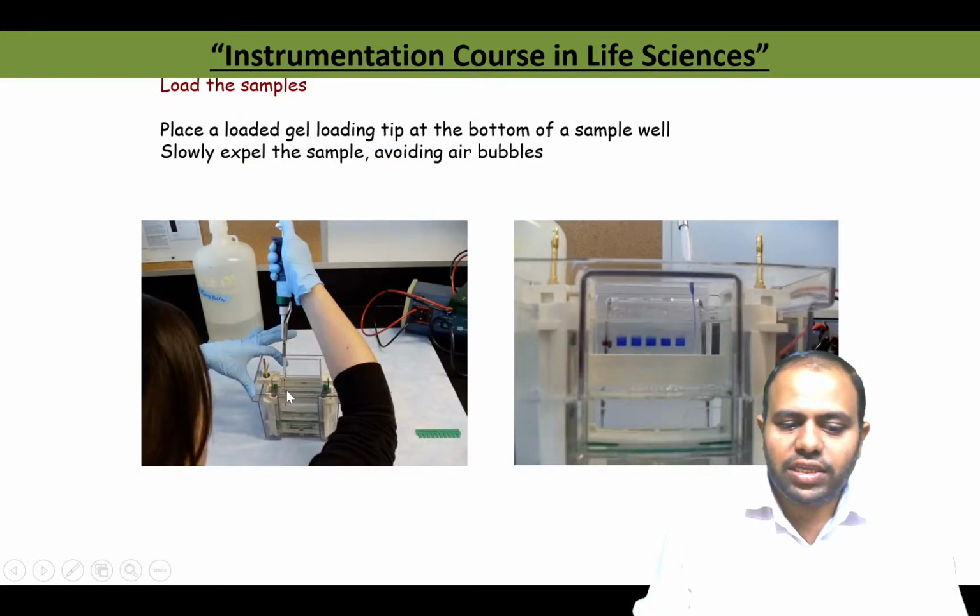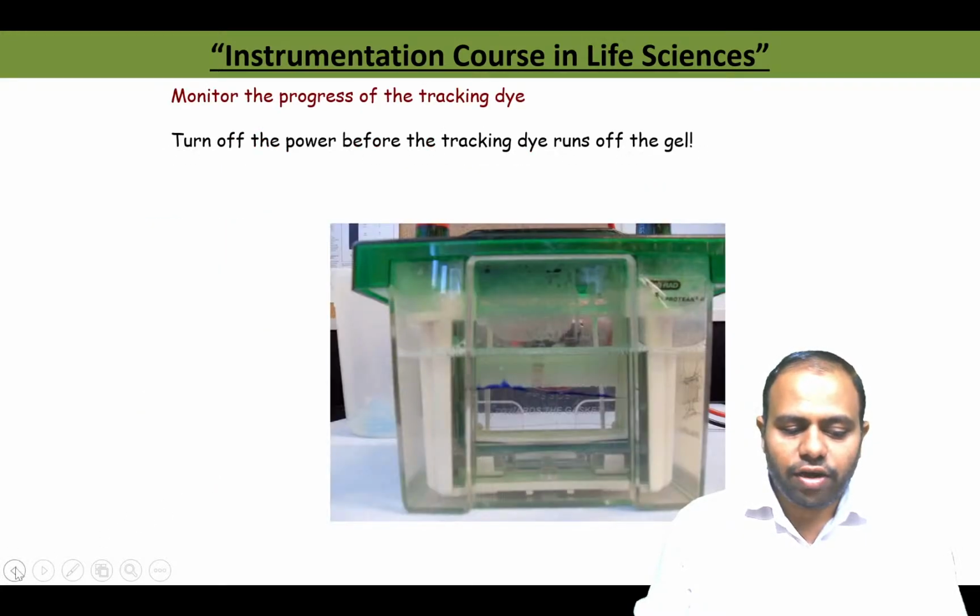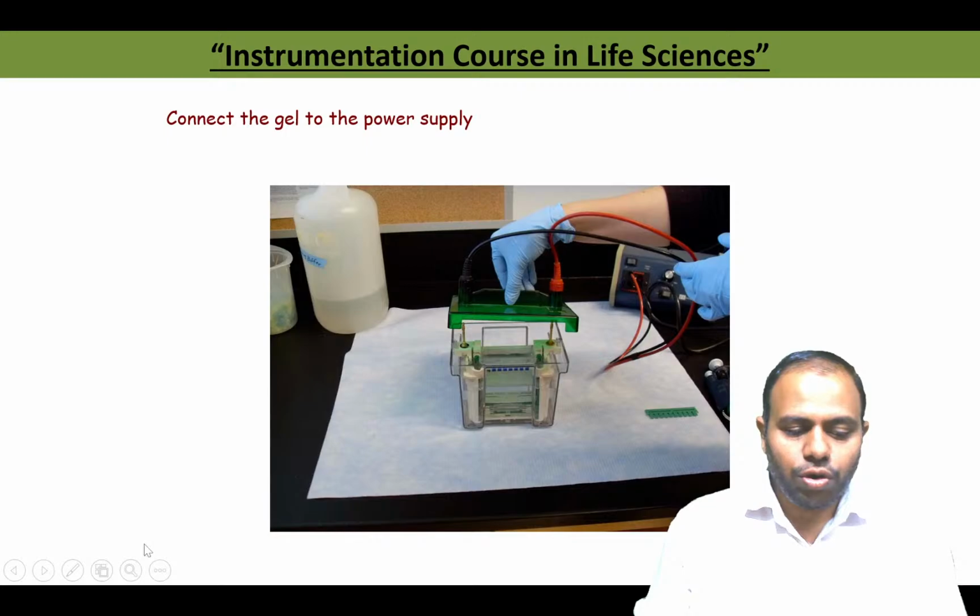You have to put the gel assembly into the tank. Then you use a long tip like this to load the sample. You can see how carefully the sample is loaded here, and you have to put on the electrophoresis. Okay, this is how you put on the electrophoresis.